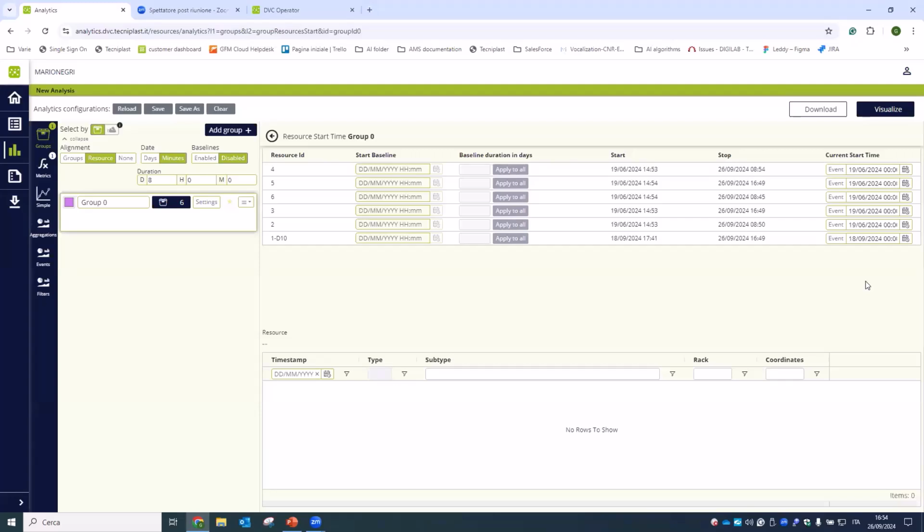Our suggestion is to realign to midnight, which is simpler, leaving the date as days, or if you enable the minutes, you have to select, at least in our vision, the same minute for all cages, because this will not impact the realignment compared to the circadian rhythm.